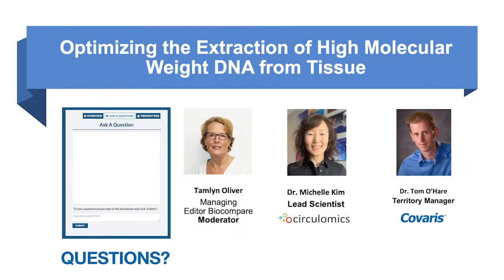But as long as the cells themselves are staying intact and they're always kept cold and frozen, which is what happens when you're using the cryoPREP, I feel that it should be fine to store it for a long time at minus 80. Okay, thank you. Another question, how does Nanobind work with samples with a high polysaccharide content?